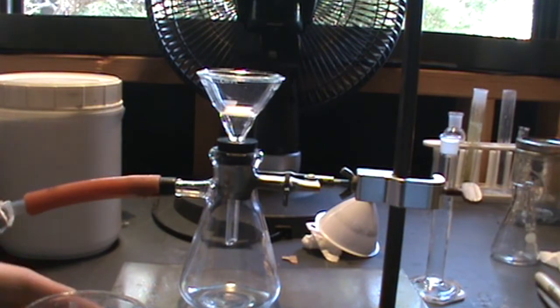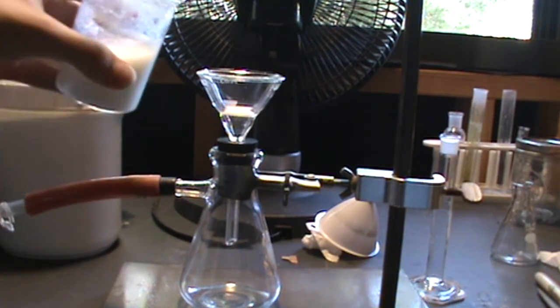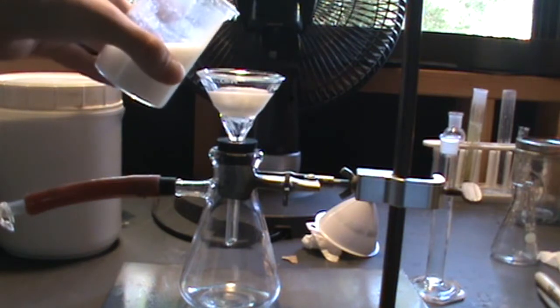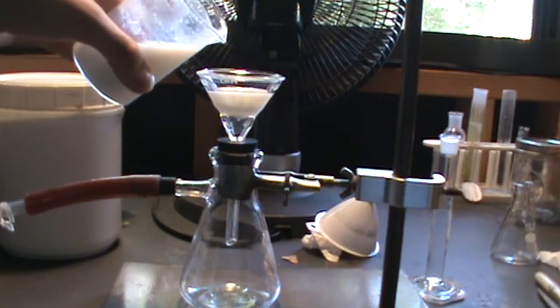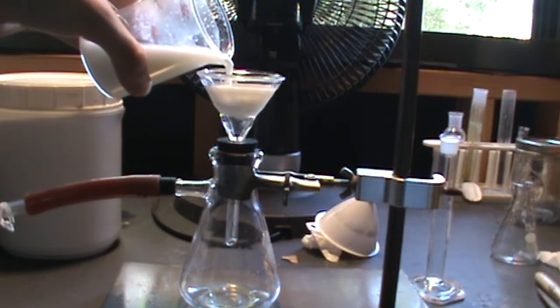Next I attempt to do a vacuum filtration to separate the precipitate. Unfortunately, the precipitate is so fine that it clogs up the fritted funnel. Because of this, I opt for a different option.